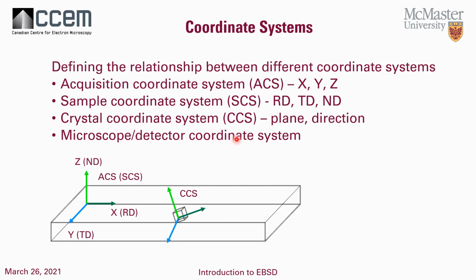So now there's also a microscope detector coordinate system, which usually should not be part of causing any sort of concern, because usually when you do the initial setup of the system, that will be corrected for.